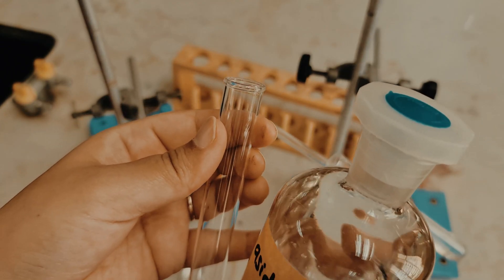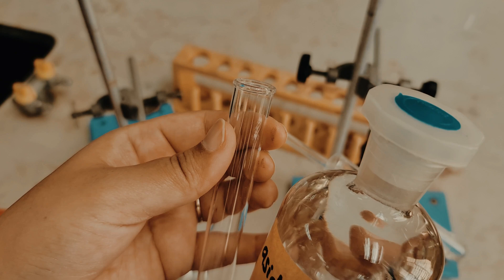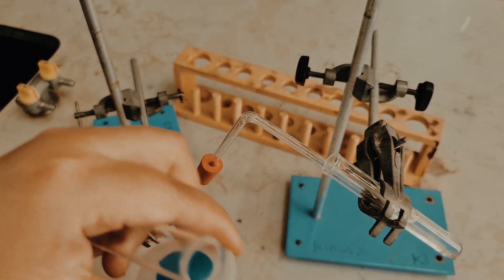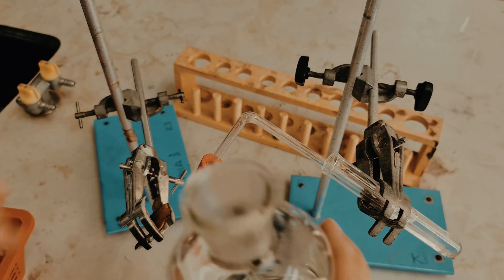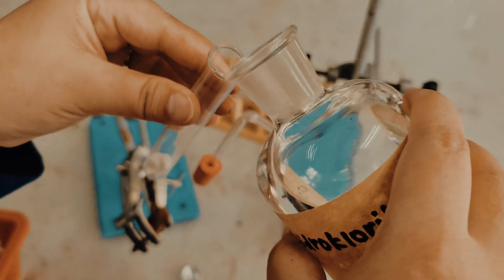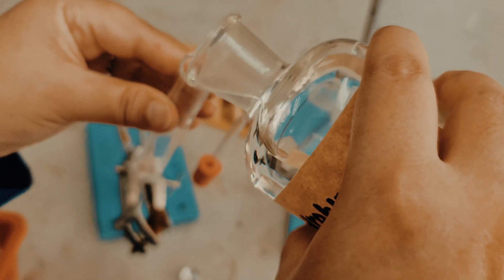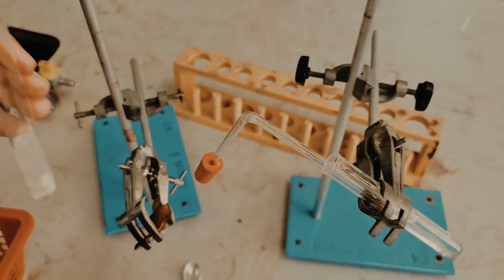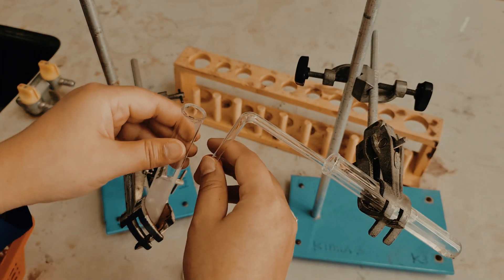And then I'm going to add some diluted hydrochloric acid to the marble chips in the test tube and seal it with the stopper.